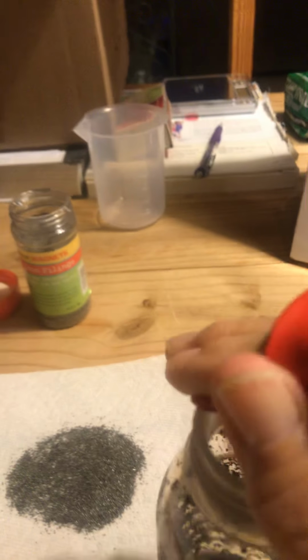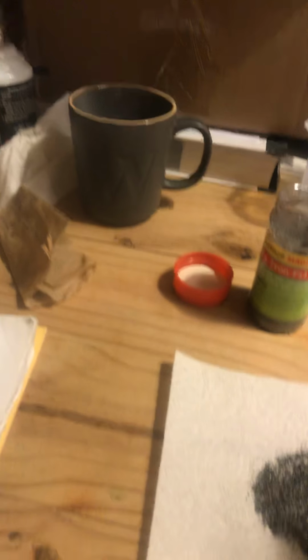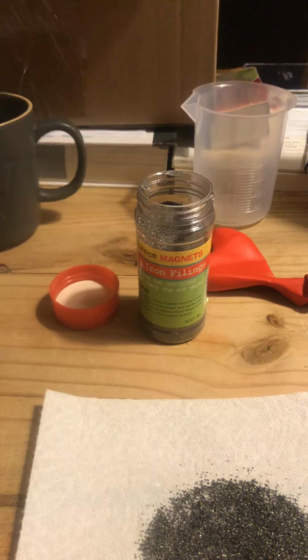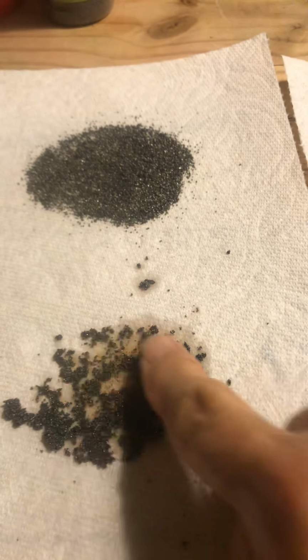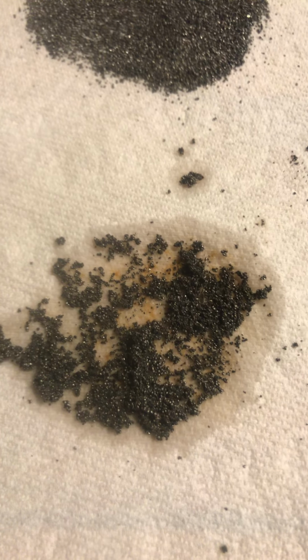Now you can take a look at the bottle. Let's take this off of the bottle, and now let's take a look at, wow, it's kind of a cakey substance, and so what we have now is a combination of water and iron, and this is what we call rust. And so it's a different color, it's a different composition, and it is what we call rust again.